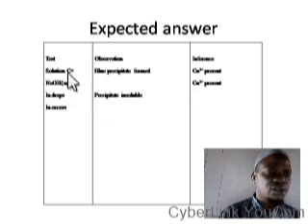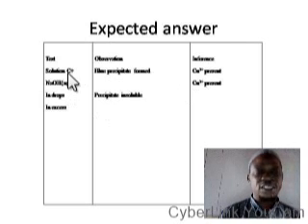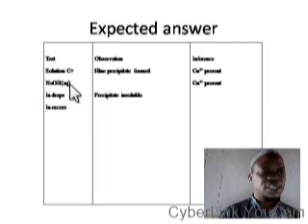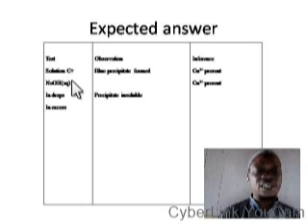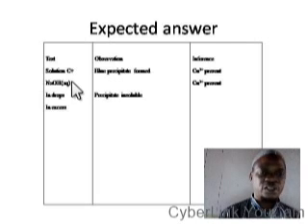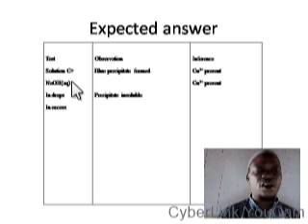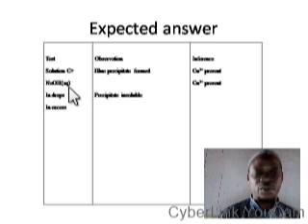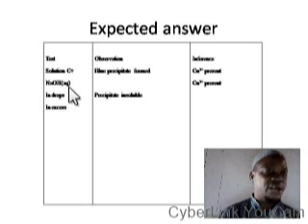Now, you have solution C, and you have a sodium hydroxide solution. The examiner asks you to add sodium hydroxide solution in drops till excess. This is how you are going to set up your test. Solution C, or simply C. Since C is given to you in solution form, it is not going to be C aqueous. Solution C, or C simply, plus sodium hydroxide aqueous. This AQ is very important because it is the one that is telling us that we are using solution of sodium hydroxide and not sodium hydroxide pellet.